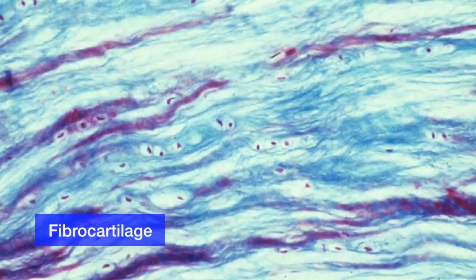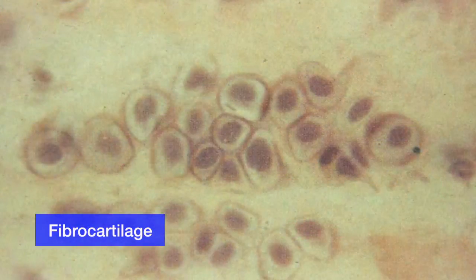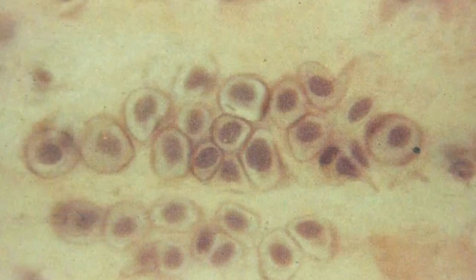Fibrocartilage. The matrix is rigid and filled with dense packing of strong white collagen fibers and scattered chondrocytes. Fibrocartilage is the strongest and most durable type of cartilage. Location: pubic symphysis, intervertebral discs, and menisci of the knee.